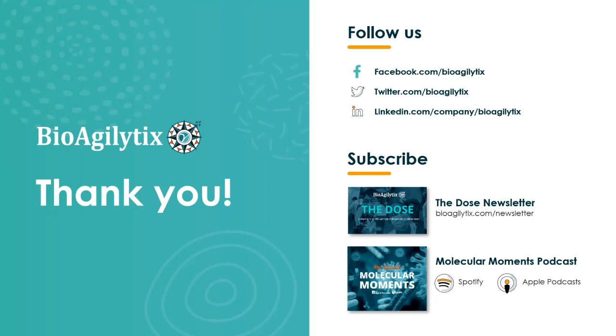Thank you both. So the next question is, when would you need to use the culture-based or PCR-based assay for CMC support? Okay, I can take this. Since the cell culture-based assay is highly sensitive and has less chance for false positive results, it is a preferred method for RCR, RCL testing.